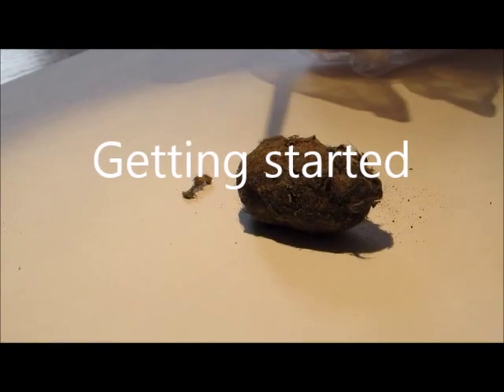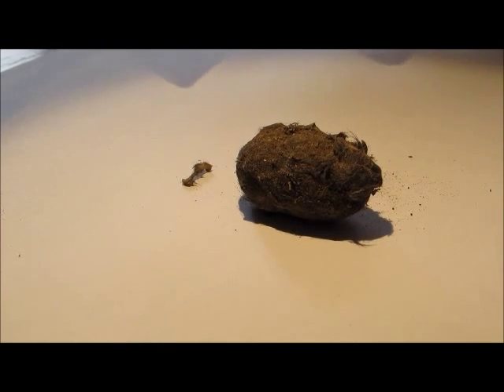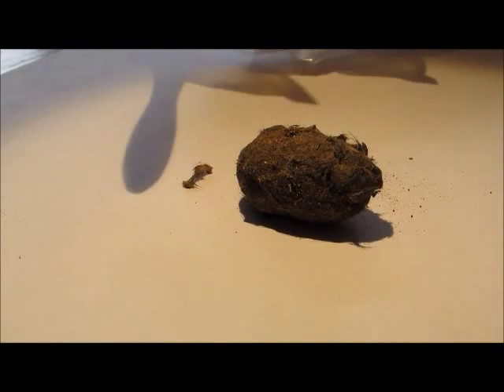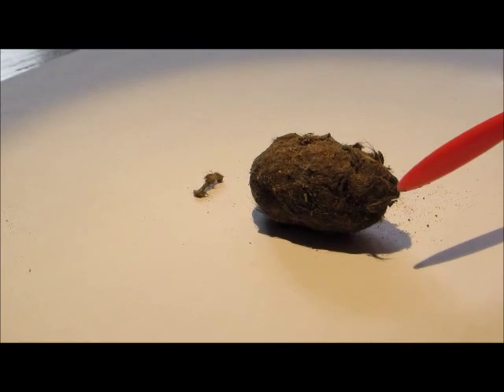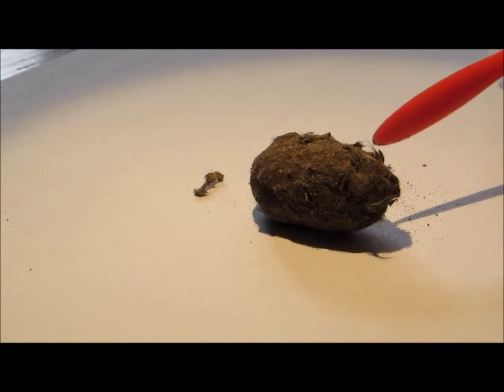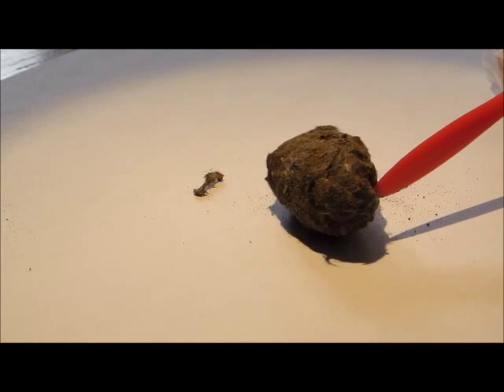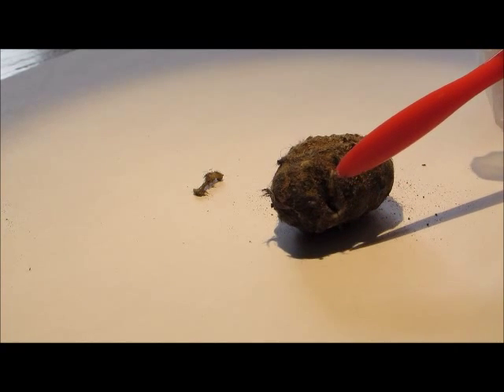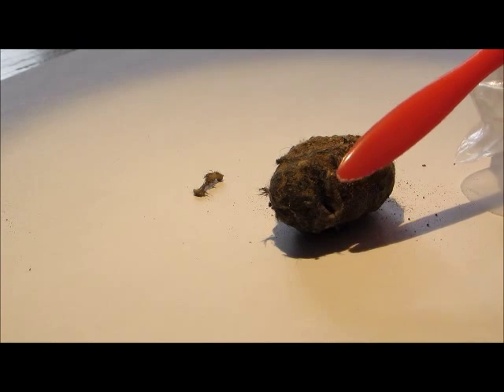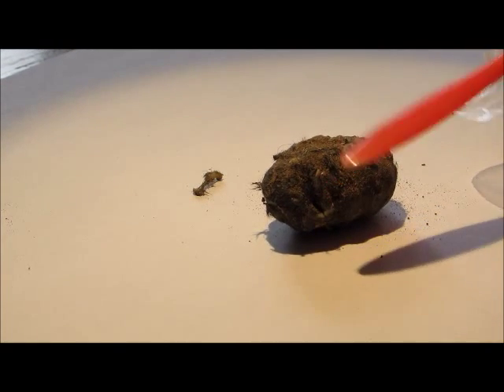I've put a little bit of extra light on this — you can see the shadow — just to see if you can make out some different things in it. You can see here that there's all sorts of different feathers poking out of it, and also some bones. The bones are what I'm going to be looking for. You should be able to see one poking out just where my stick is here, and that's the first one I'm going to be dissecting.